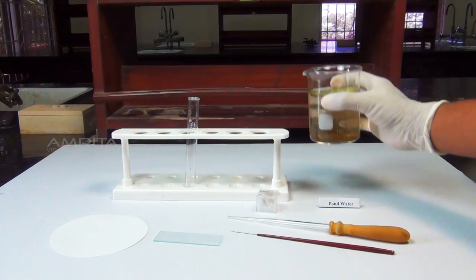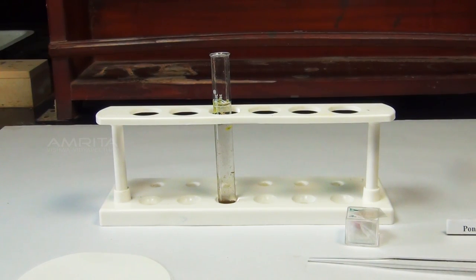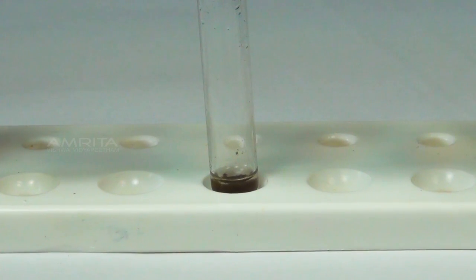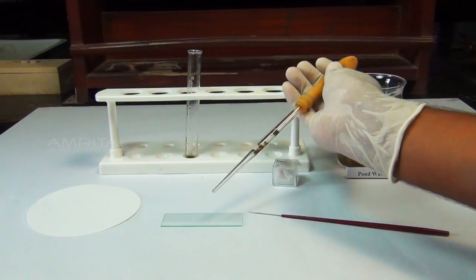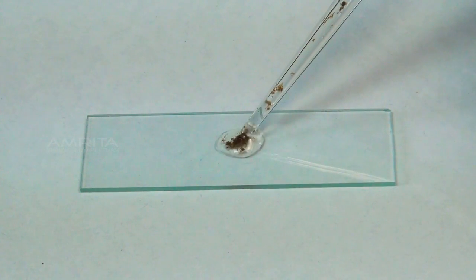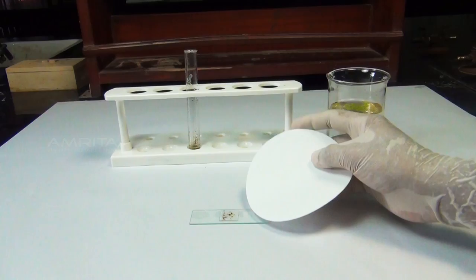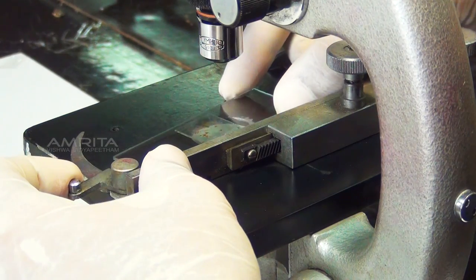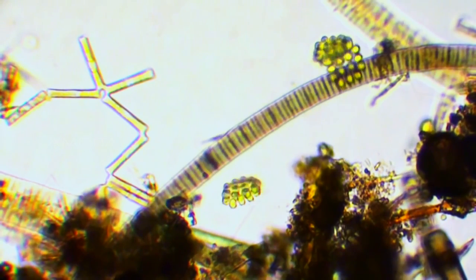Procedure: Take a beaker containing pond water and pour it into a test tube. Leave the water sample undisturbed till the sediment settles to the bottom of the test tube. Decant the clear water, leaving concentrated sediment at the bottom. With the help of a dropper, transfer a drop of water from the test tube to the center of a glass slide. Take a cover slip and place it gently on the slide with the aid of a needle. Remove the extra water using a filter paper. Place this glass slide on the stage of the compound microscope and view it. Observations: We can observe a large number of different organisms in water sample.